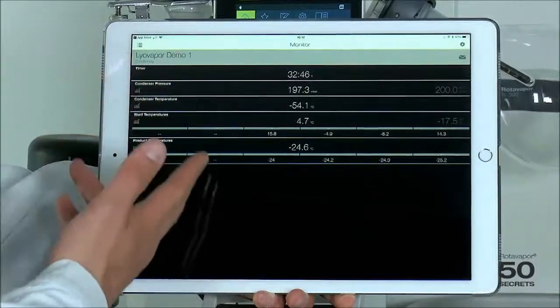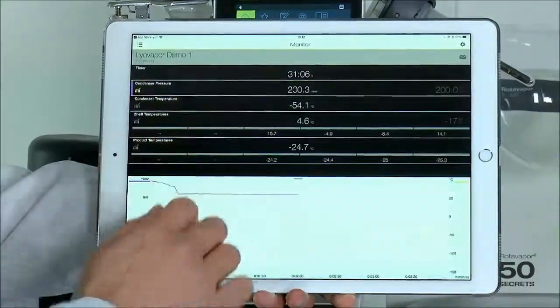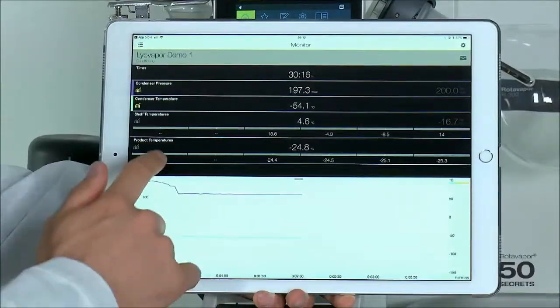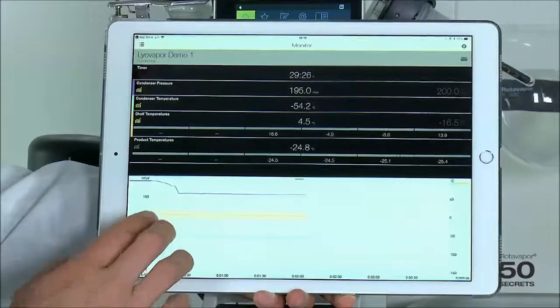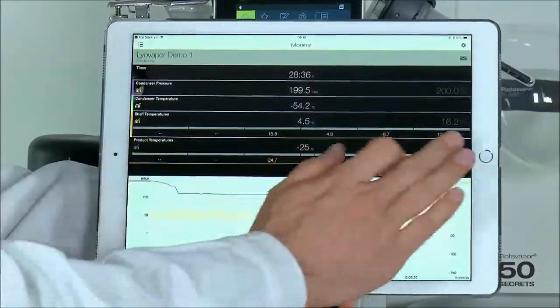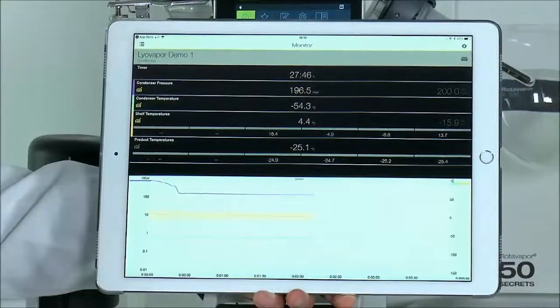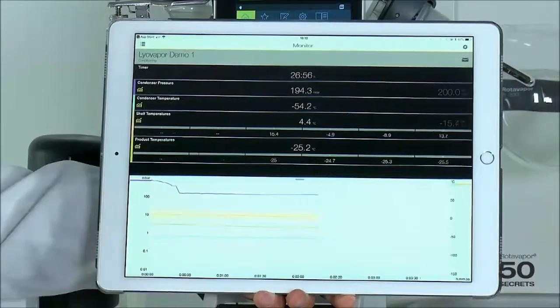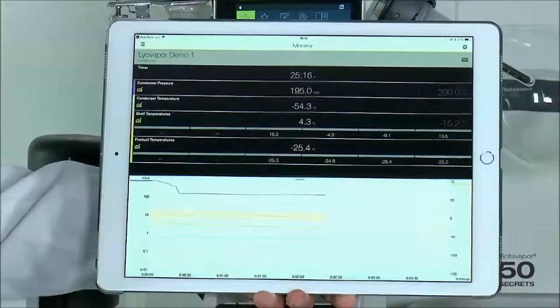Here we see the liovapor data. We see things like the condenser pressure, the temperature, and the shelf temperatures. This chart is quite special — you can see the different shelf temperatures displayed inside this band, so it's very easy to see what is actually happening. The last parameter is the product temperature. That is the view for the liovapor.